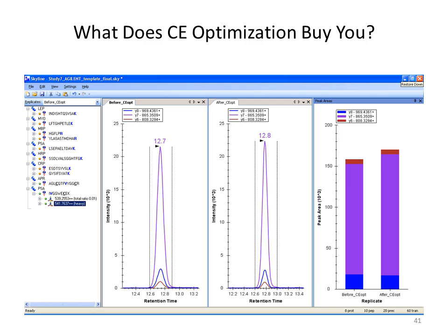So what does it buy you? It doesn't always buy you much. I optimize if I have time. I optimize if I'm going to be gone for the weekend and I can just let the system chug. I'll put in the methods and run it. But oftentimes, this is working with the regression equation. That's the intensity we get, and after it's been optimized, that's not even a 10% improvement.